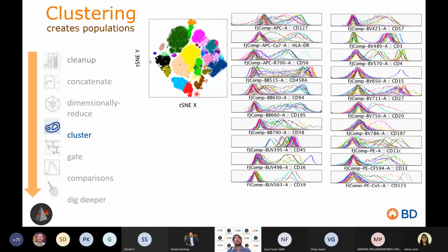So basically what it does, when you derive some clusters, actual clusters with similar phenotypic expressions, then you can just drag and drop everything on your layout editor in FlowJo. And then this option is for multi-graph overlay, where you can get a histogram with relative expression of each of the measured parameters in your experiment, and see how they are changing across the different clusters.